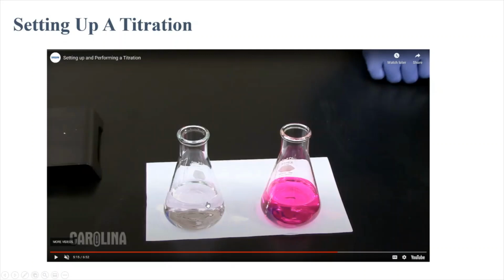You want just the teeniest bit of color, and then you know you've gotten to the endpoint, where the sodium hydroxide is now starting to be in a teeny little bit of excess to give us some color. That's a distinction I wanted you to be aware of. So this one is what we would consider to be accurate. And then you're going to do 3 of these where you get a very accurate volume and the color is barely pink.